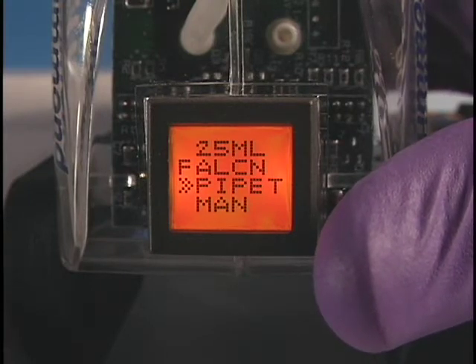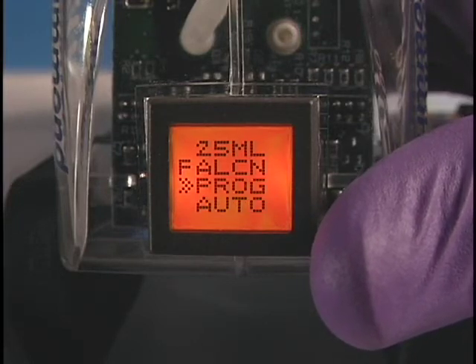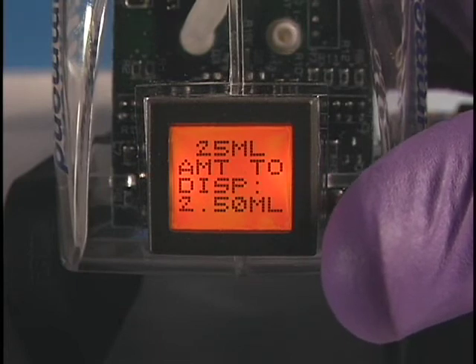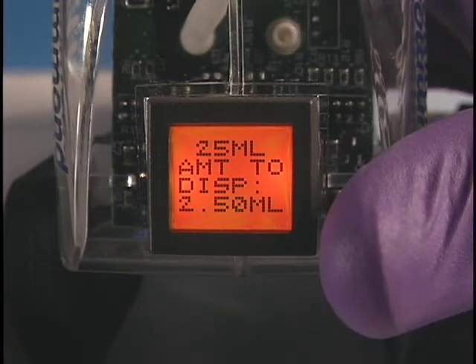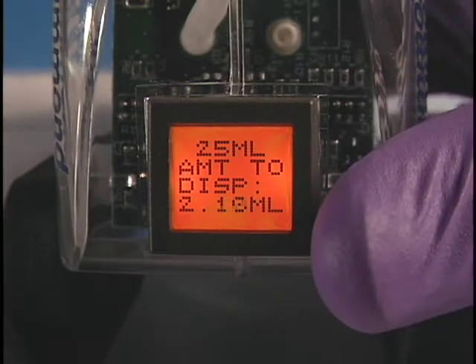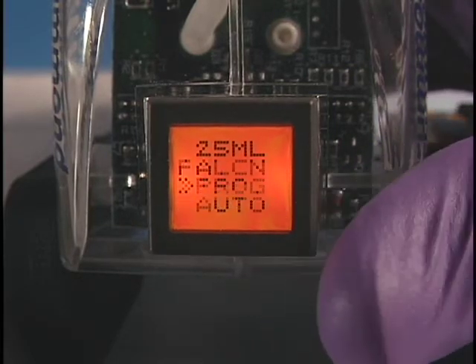The size and brand of pipette is confirmed. Scroll to Program and press the Menu button to enter. The amount to dispense will appear. Dispense volume can be varied by scrolling to the volume desired. Today, we are dispensing 2 milliliters. Press the Menu button to select.